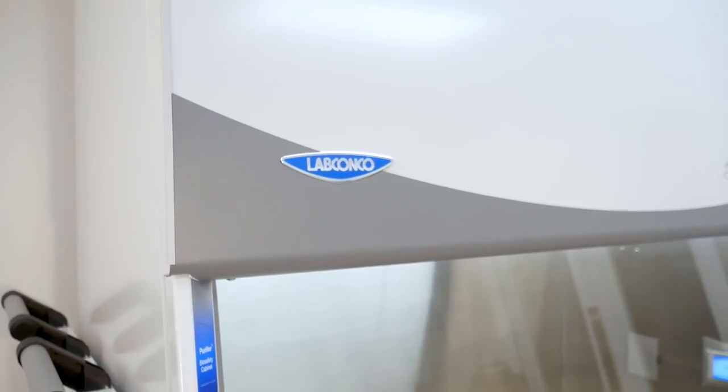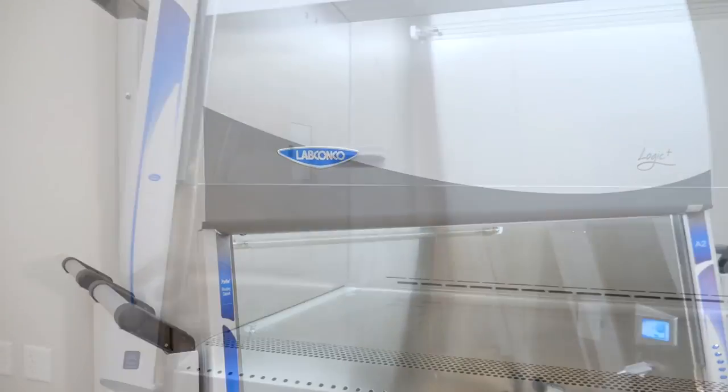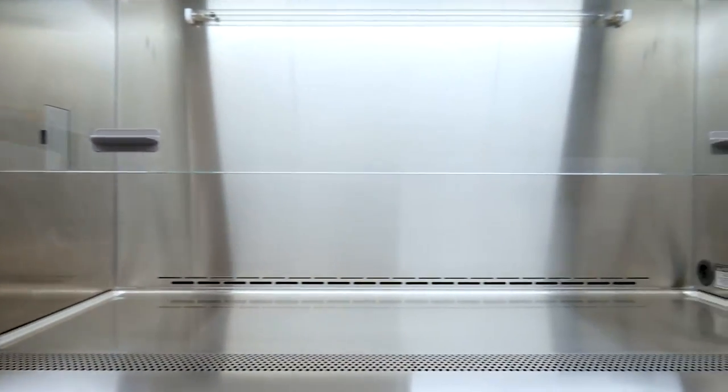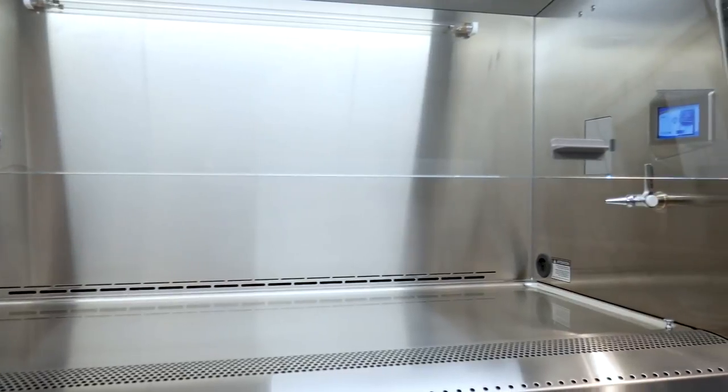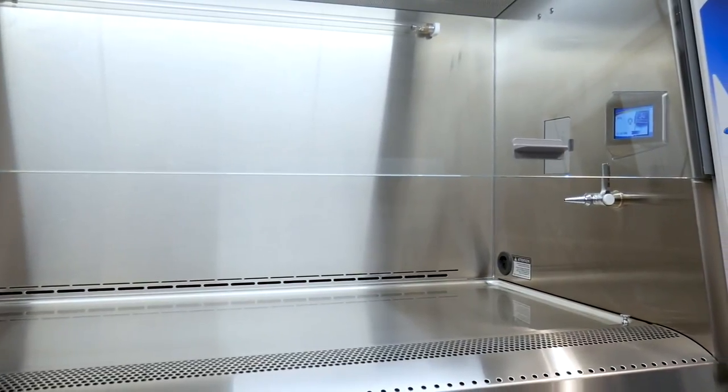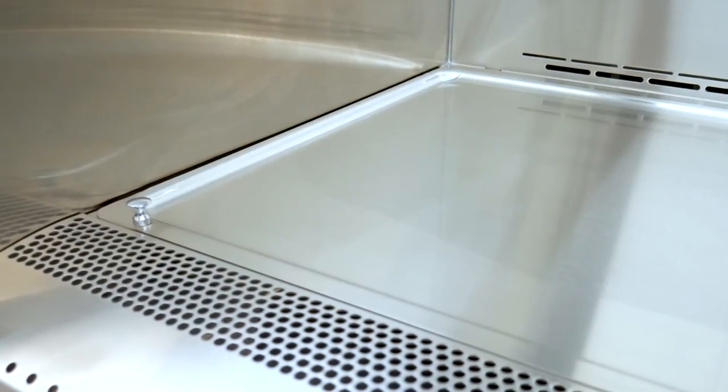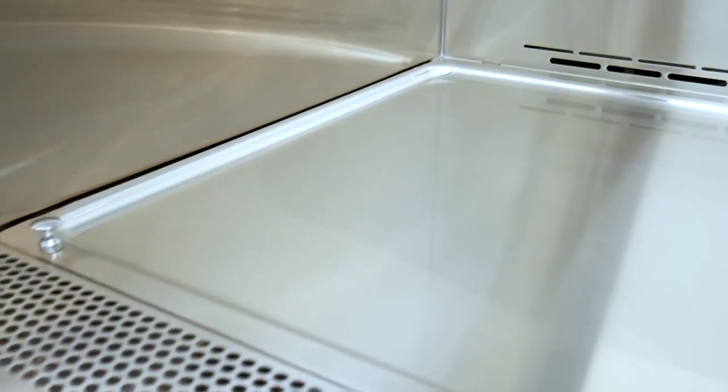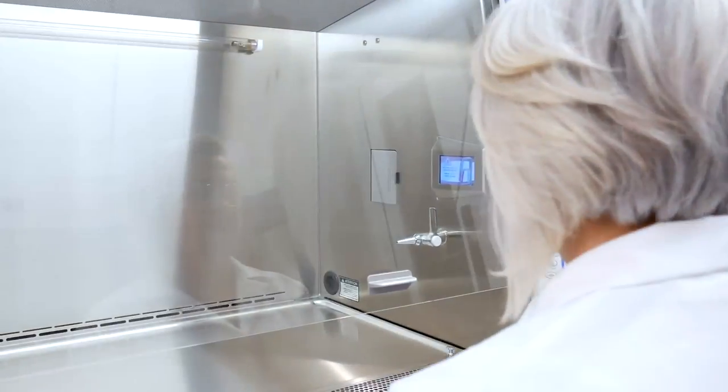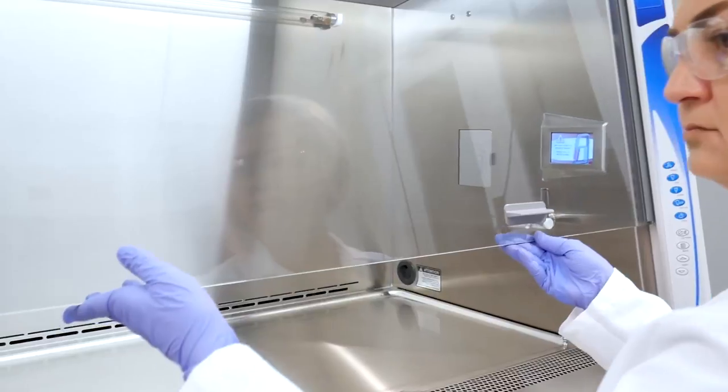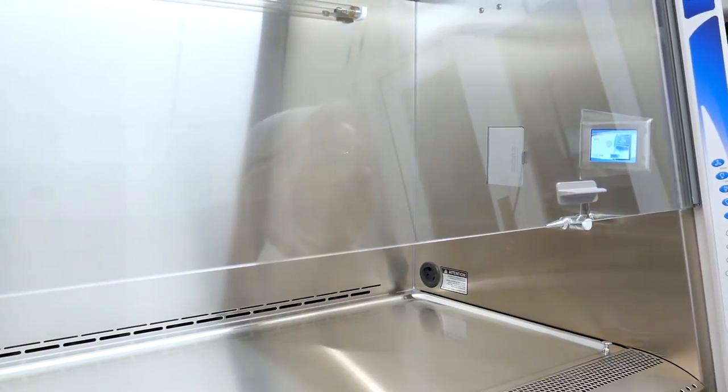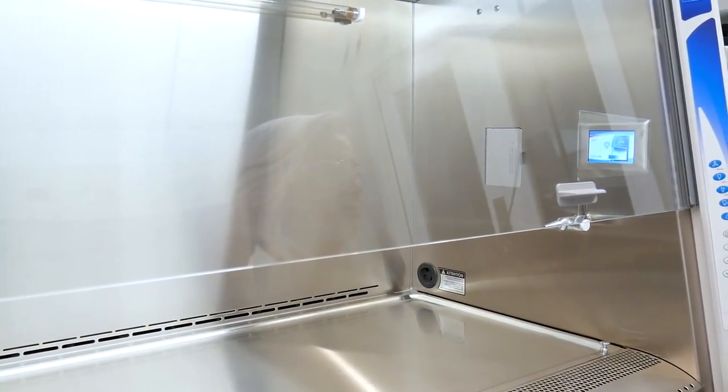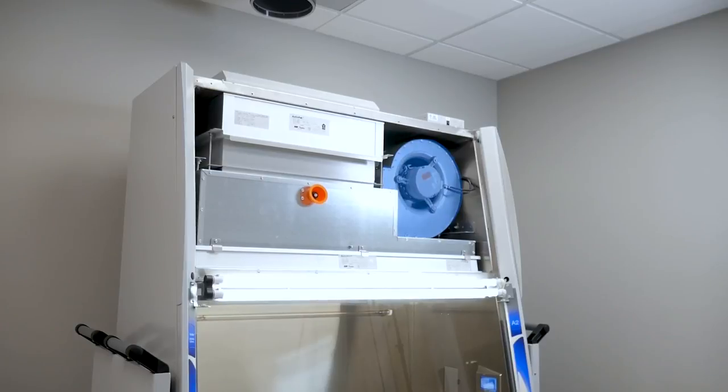Key parts of LabConco BSCs include a solid negative pressure hull constructed of stainless steel that contains biohazards, a seamless work surface with coved corners for easy cleaning, a glass sash that directs airflow through the cabinet and protects users from accidental splashes, and a powerful yet quiet internal blower which moves air through the BSC.